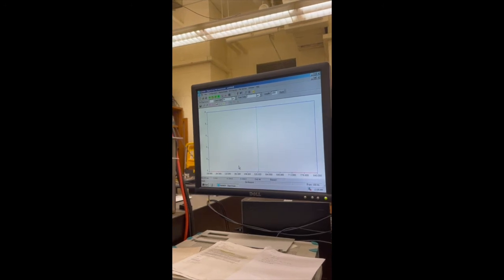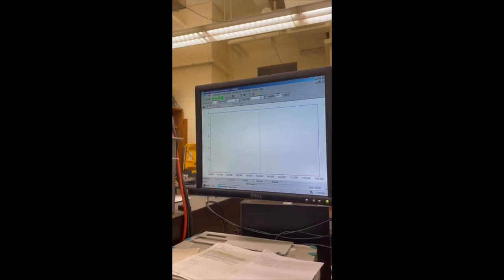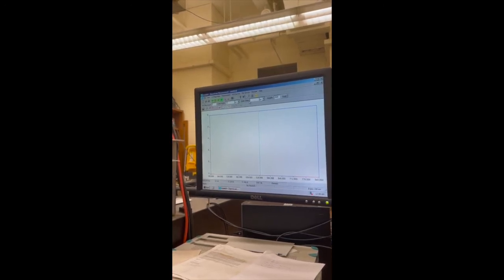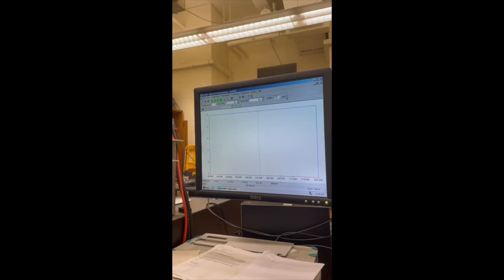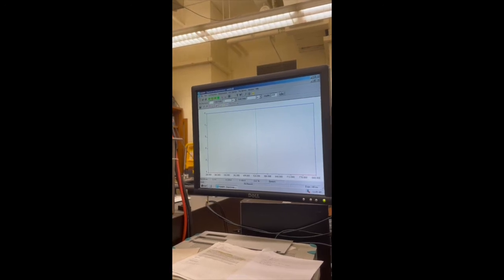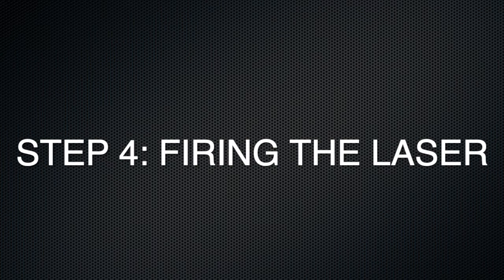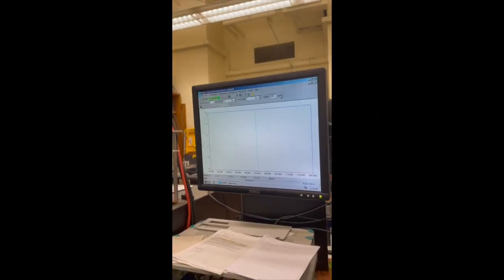And now if you look, those exact same windows that you were just editing through the configuration hardware settings are also altered on that row right there. So you could have made those changes in these windows as well. Just make note that if you change anything in those windows, you have to hit apply afterwards for them to take effect. You can type in that window, but it won't take effect until you hit apply. Those are basically the parameters you need for shooting steel.